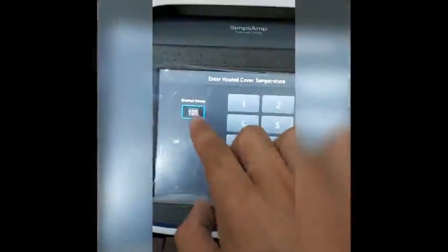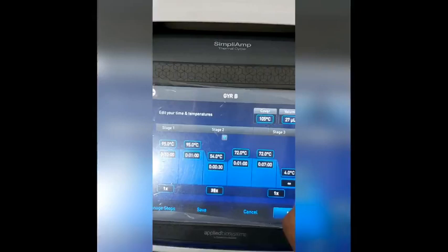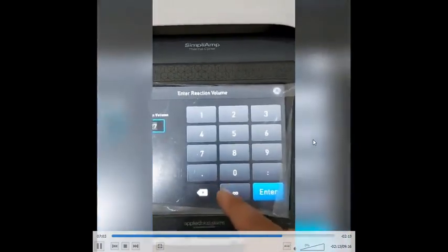Other settings shown on the screen include the lid temperature, which in this case is 105 degrees centigrade. We keep the lid temperature higher than the denaturation temperature to prevent evaporation of the PCR reaction mixture — if the lid temperature is high, it prevents evaporation and keeps the concentration of the reaction mixture undisturbed. The volume for this PCR is 25 microliters: 24 microliters of master mix solution plus 1 microliter of DNA.